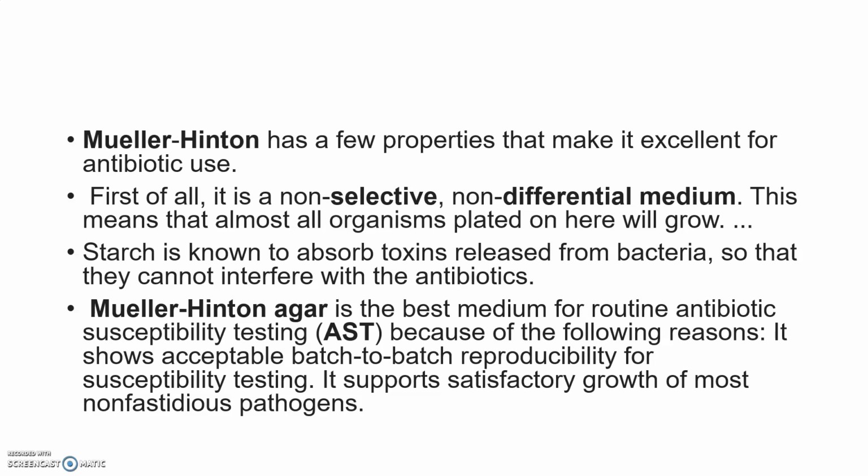The Mueller-Hinton agar has a few properties that make it excellent for antibiotic use. First of all, it is a non-selective and also non-differential medium. This means that all organisms can be plated on this type of medium. Starch is known to absorb toxins released from bacteria, so that they cannot interfere with the antibiotics. So starch is present in the medium.